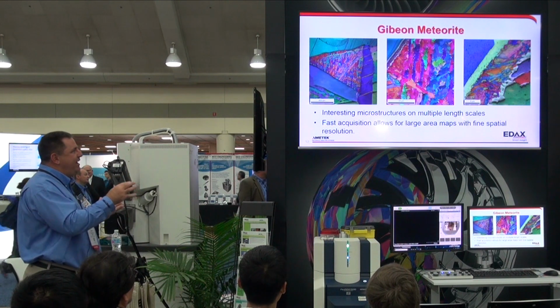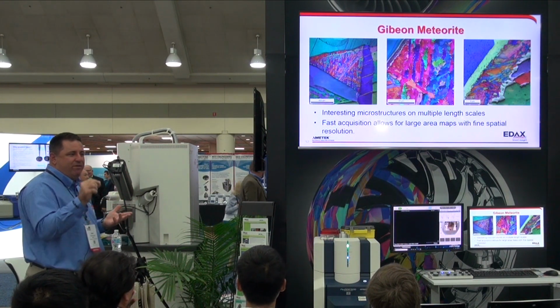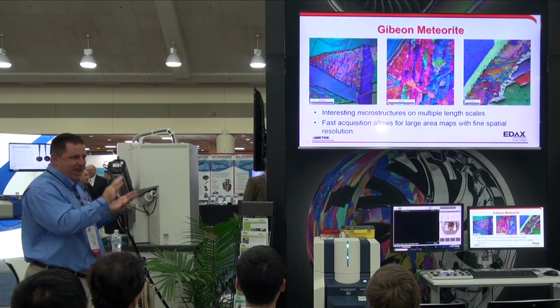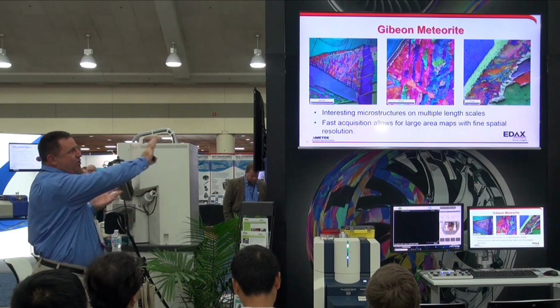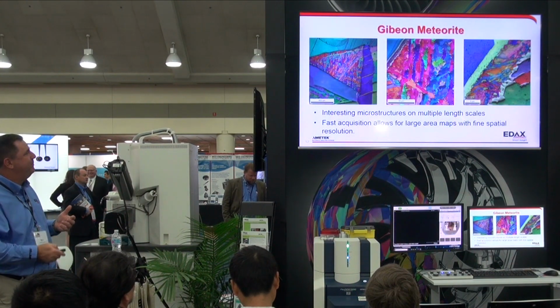So with these fast acquisitions, you can start to think about saying, I can collect large areas with very fine resolution and have that all together. And so that's one area where it would make really good sense to have the best of both of those together.